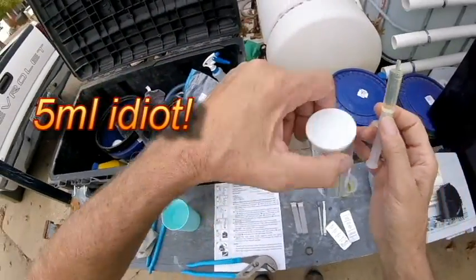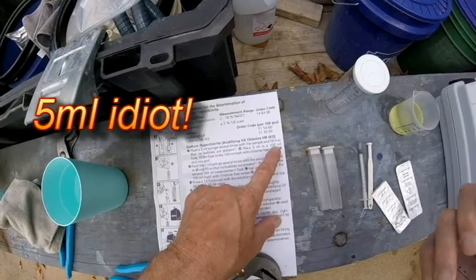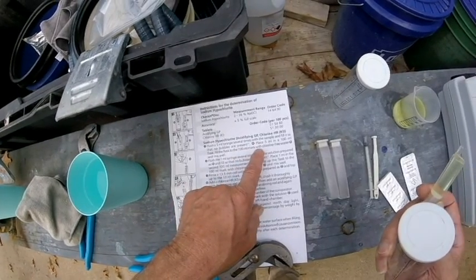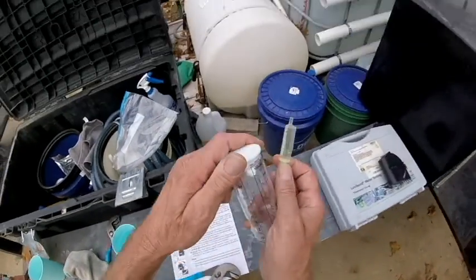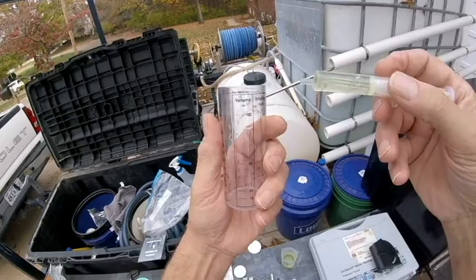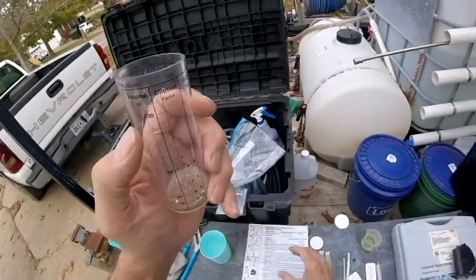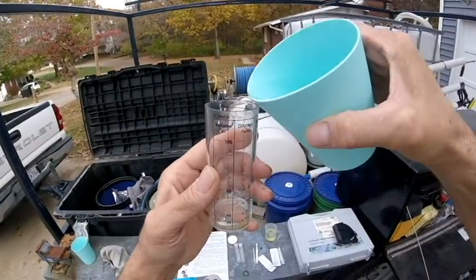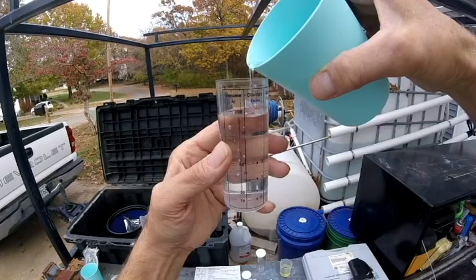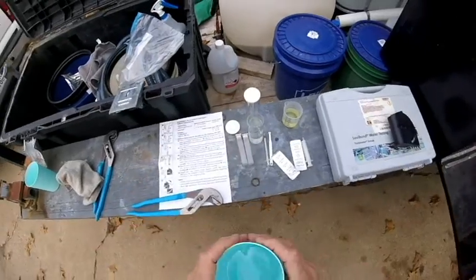Now we take the 5mL — it says place the 5 milliliters in a 100mL flask. Fill the flask to the 100mL mark with chlorine-free water and mix well — so a total of 100 milliliters. We'll put this 5mL in here and pour our water in until it gets to 100. There's our first sample — we've diluted it now.